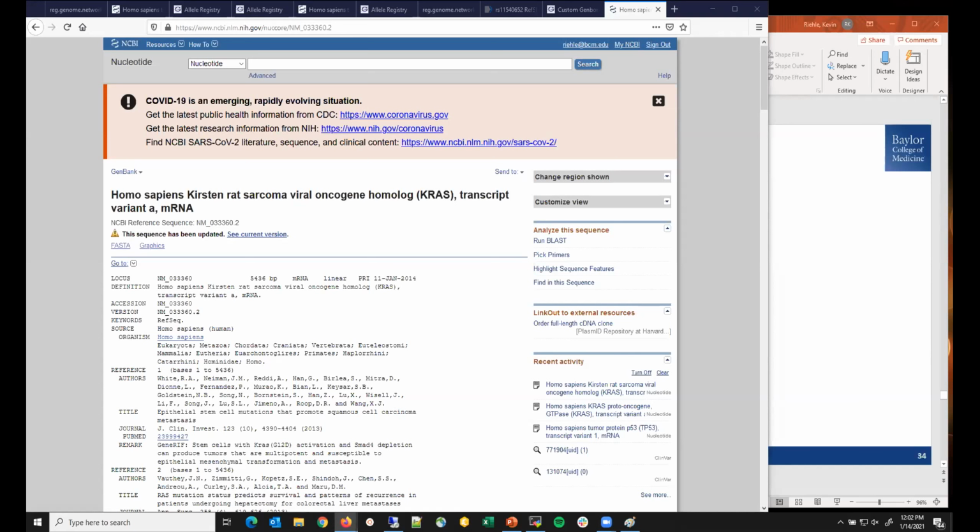I can specify. For example, for the LDLR gene, the numbering of the amino acids changed a while back. So the same variant that was amino acid change 41 is now called 62, for example. So the numbering of the whole gene changed, and in older papers we have the P T 41 M, but we now know this refers to what we now call P T 62 M, if that makes sense.